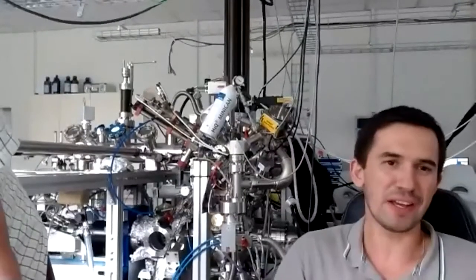If it's powder, usually we take some foil or some inert metallic mesh, and we press the powder in, and then we somehow fix it to this sample holder. What we have are films. And the films usually have one part that is not covered, like the silicon oxide substrate, and we have the film, but one part is probably bare, but it can be small. Actually, we have substrates that we can cut to our requirements. So 1 by 1 is fine, but maybe even smaller is possible.